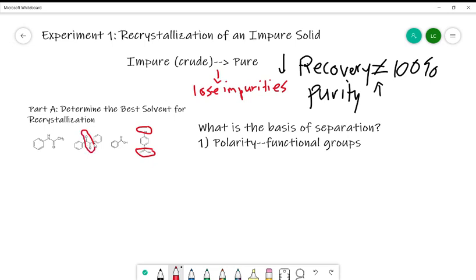One thing to note about benzil is to make sure not to say it's completely nonpolar. I see this happen sometimes: people say there's a dipole, and they think the trans version and the cis version are different. They aren't, because there's a single bond, so it rotates about the single bond. So just be sure not to say anything about dipoles. Here we have an amide group.